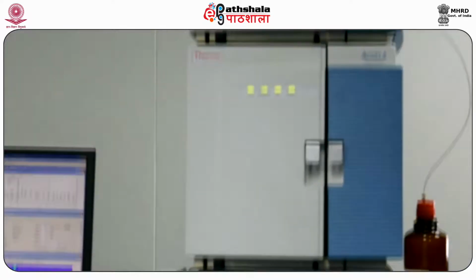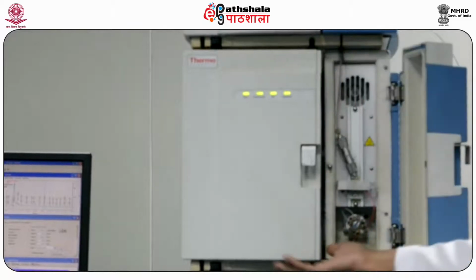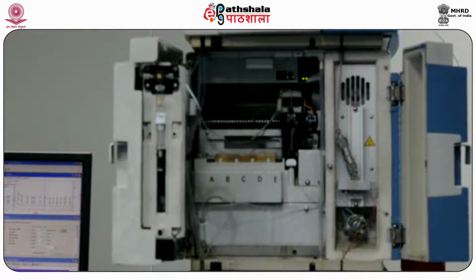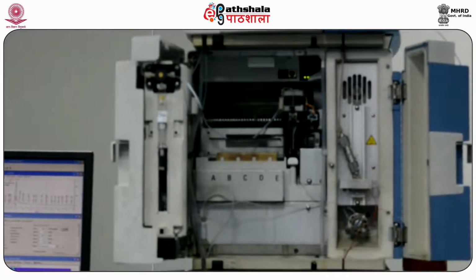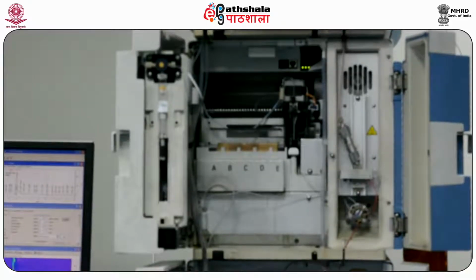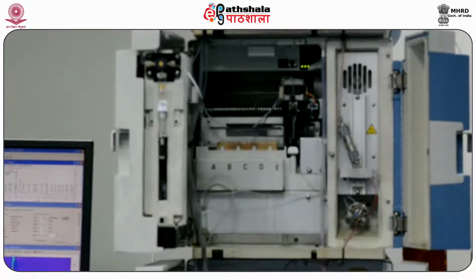To make the auto injection possible, what you see here is the compartment for the column and injector, and here is a sampling port with a robotic arm through which the sample is picked up from the 96-well plates by the syringe and loaded into that Rheodyne injector. The injector is pneumatically controlled, and once it gets the trigger, it opens up and feeds the sample inside the column.